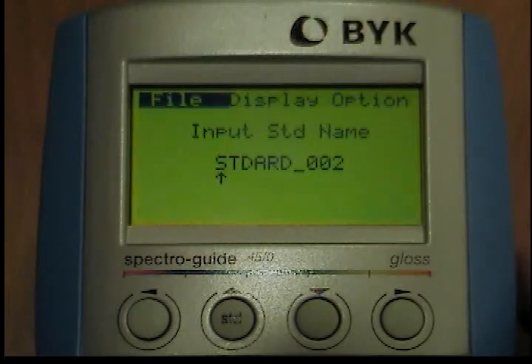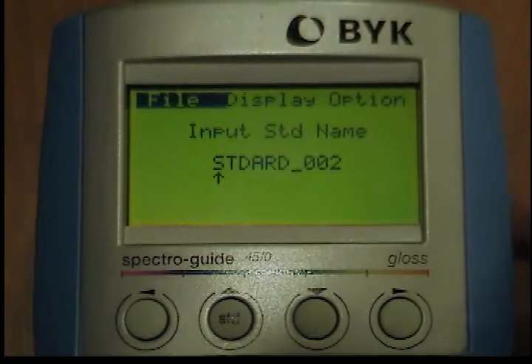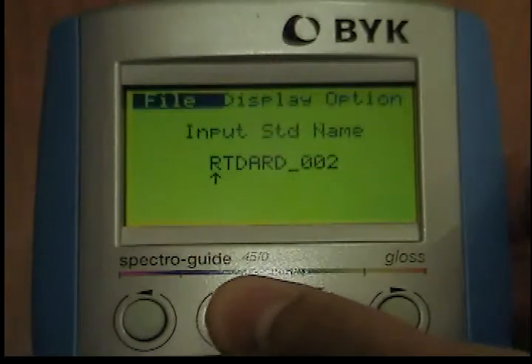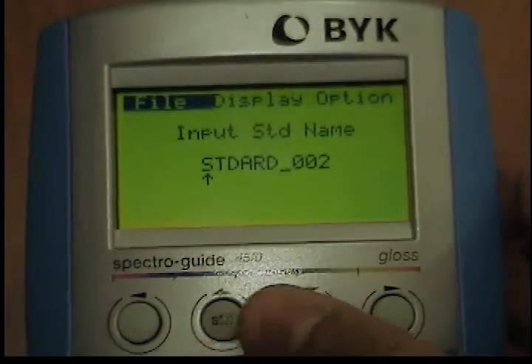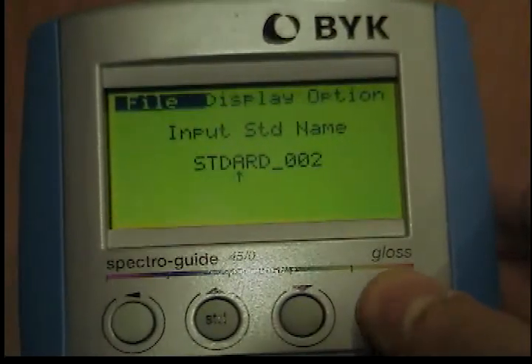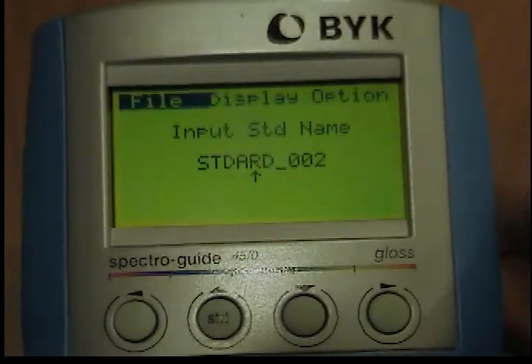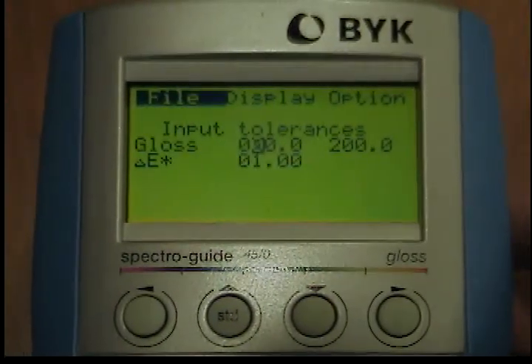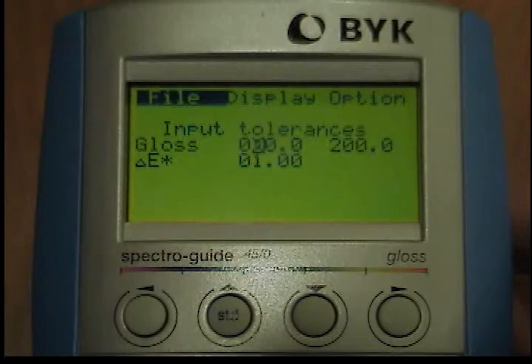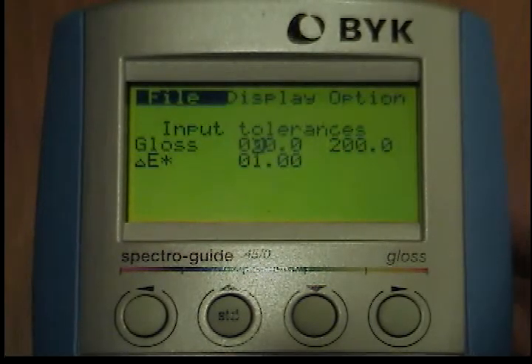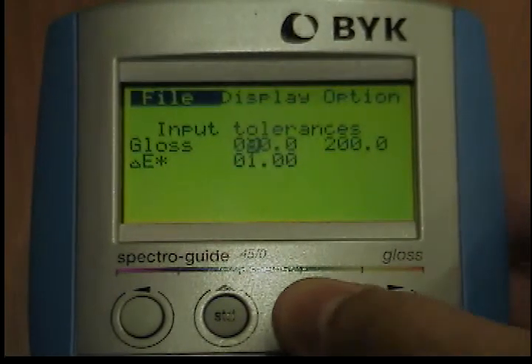You can use the Up and Down buttons to select the appropriate letter at the position of the arrow. Use the Left button to move the arrow to the next letter. When you are finished with the input operation, press the Operate button. The menu will appear for the tolerances. Enter the appropriate values and then press the Operate button.